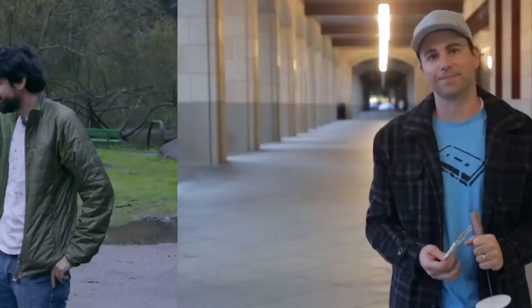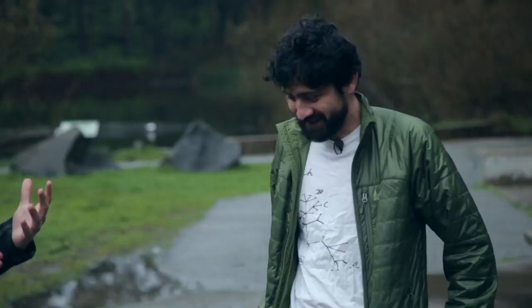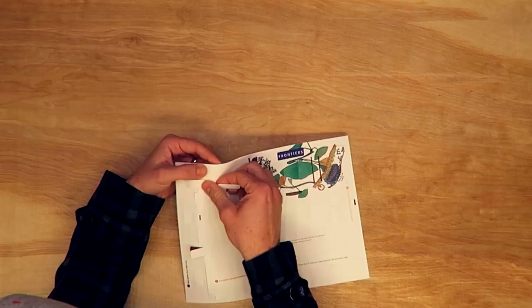Manu, good to finally meet you. Absolutely. You're like a superhero. I don't know about that. From an engineering perspective, what you do is amazing. Now, before I continue with Manu, let me just support that statement by showing you how this 50-cent paper microscope actually works.